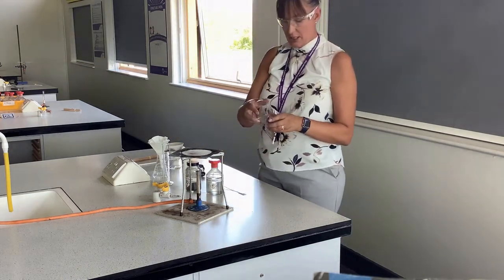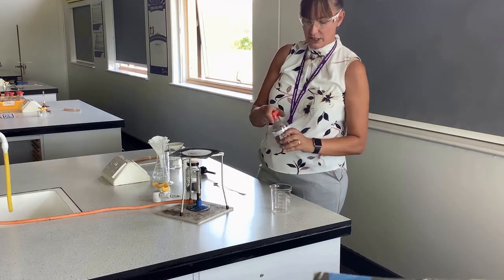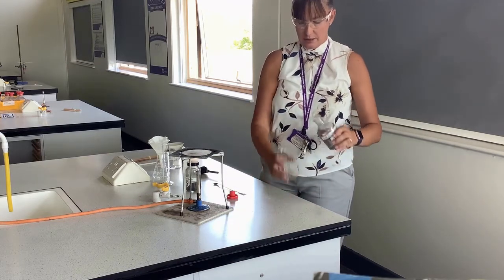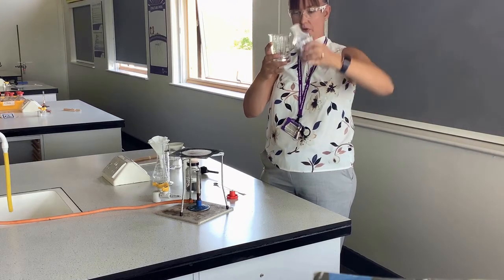Right, so first of all, I'm going to take approximately 50 centimetres cubed of sulfuric acid. This isn't a quantitative experiment, so I don't have to be super accurate.